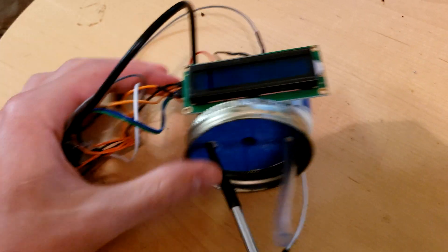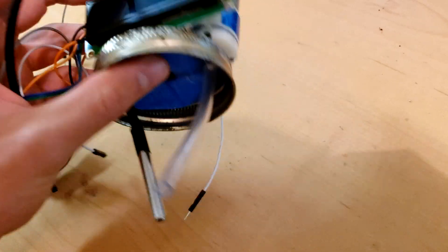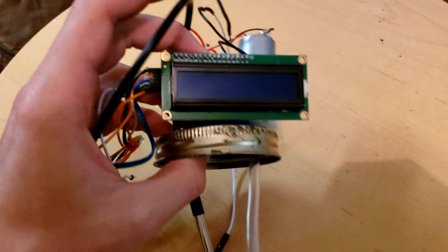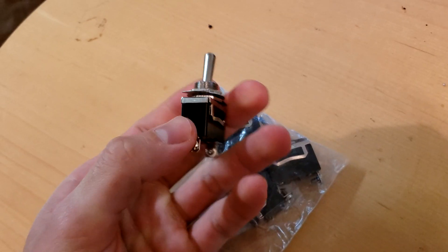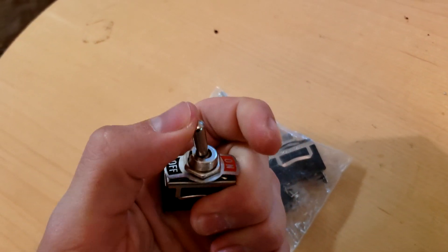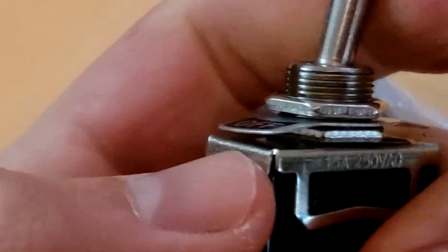We got the DIY bioreactor that actually does work still. It's got the stir bar salvaged from it though. A little DC motor and these switches that make me very happy.